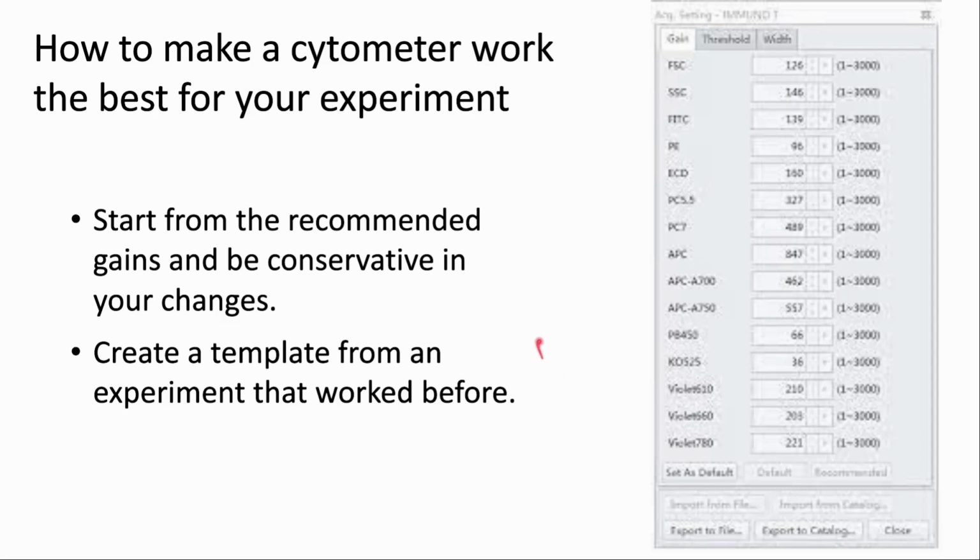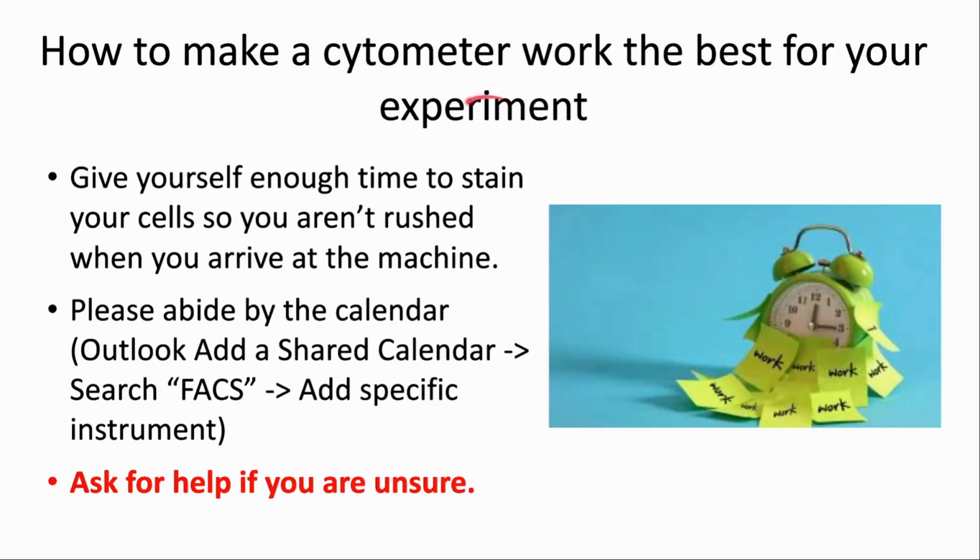We would also recommend that users give yourself enough time when setting up and performing your experiment. This can often be the case where prepping the cells, staining the cells, and washing the cells takes more time than planned, and users may end up being or feeling rushed when they arrive at the machine.